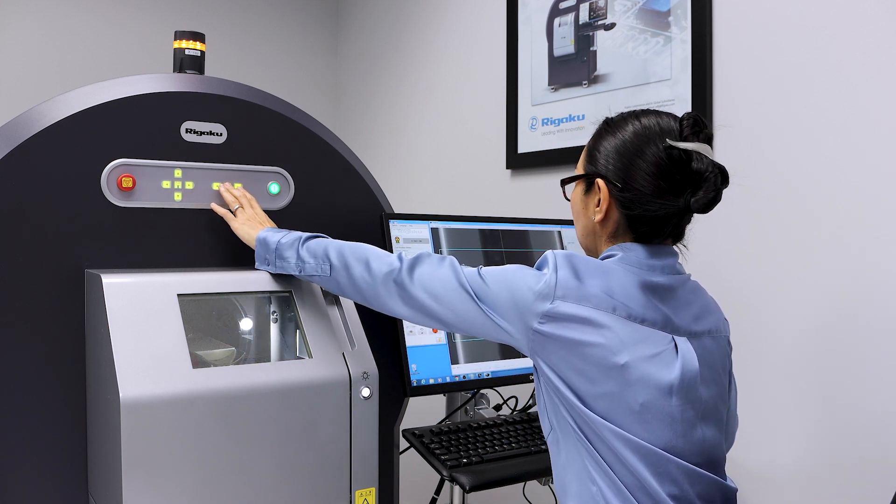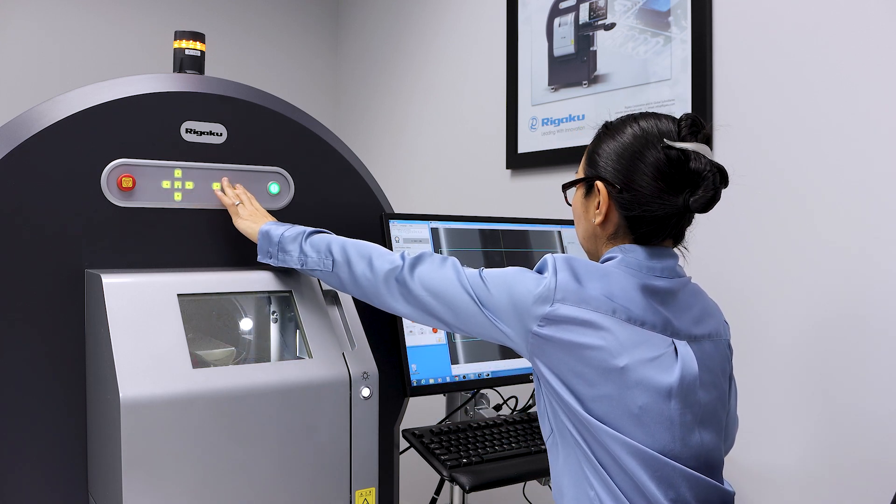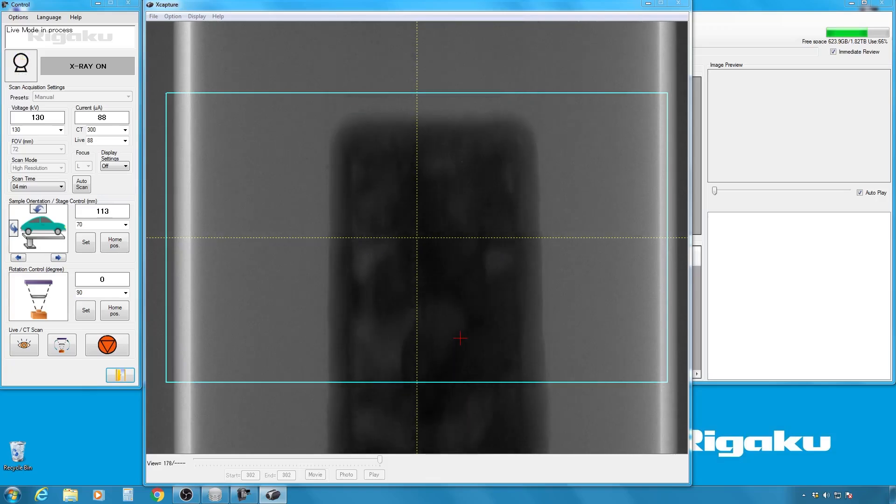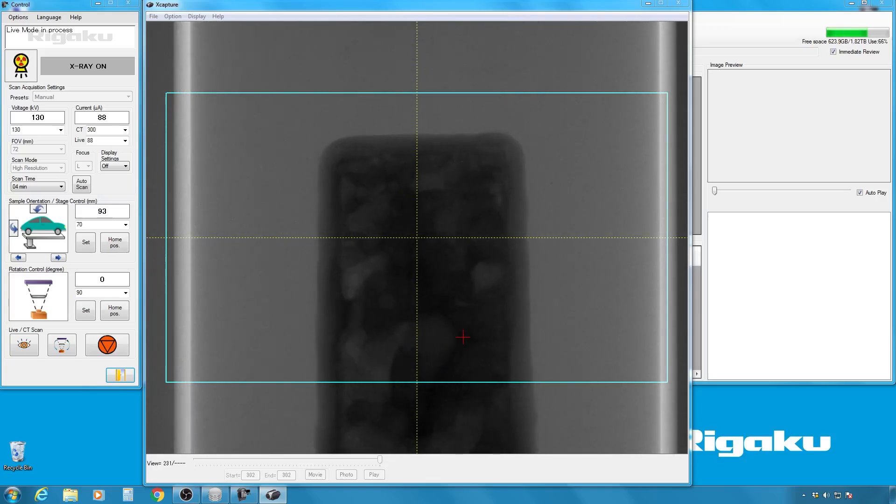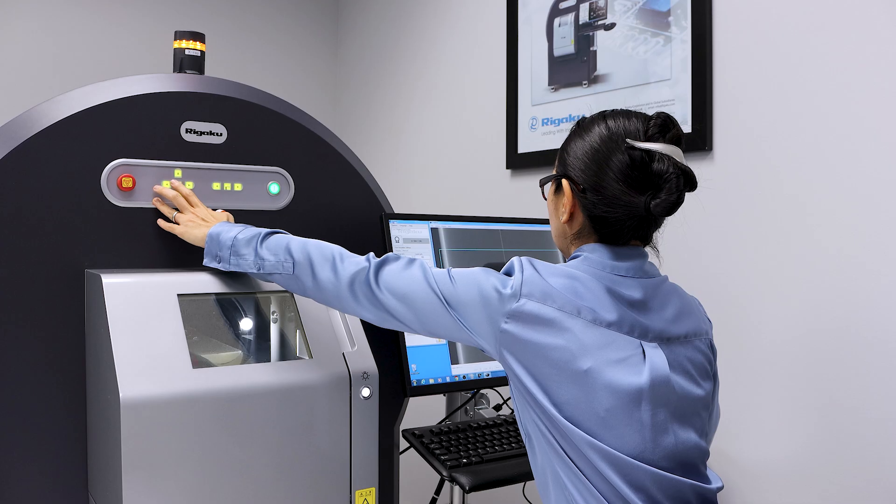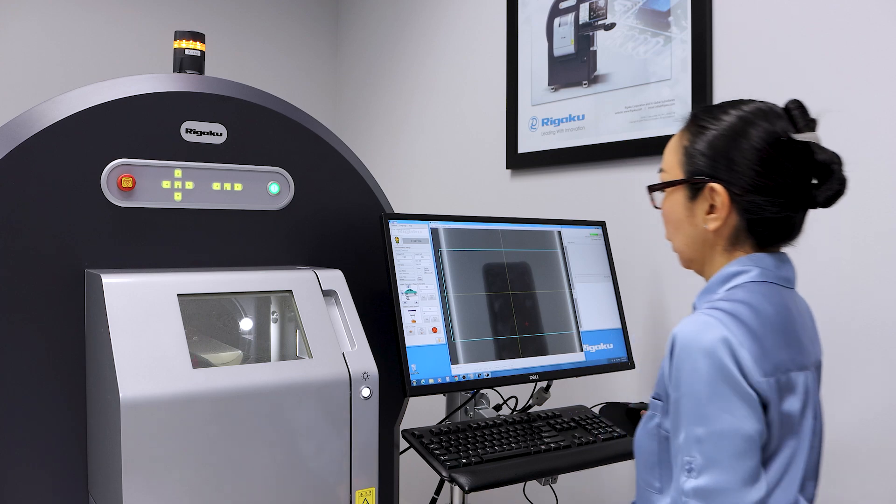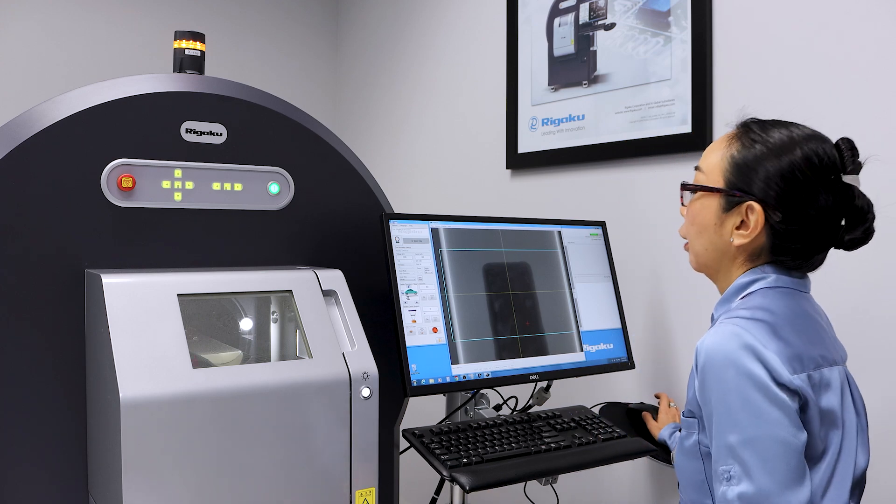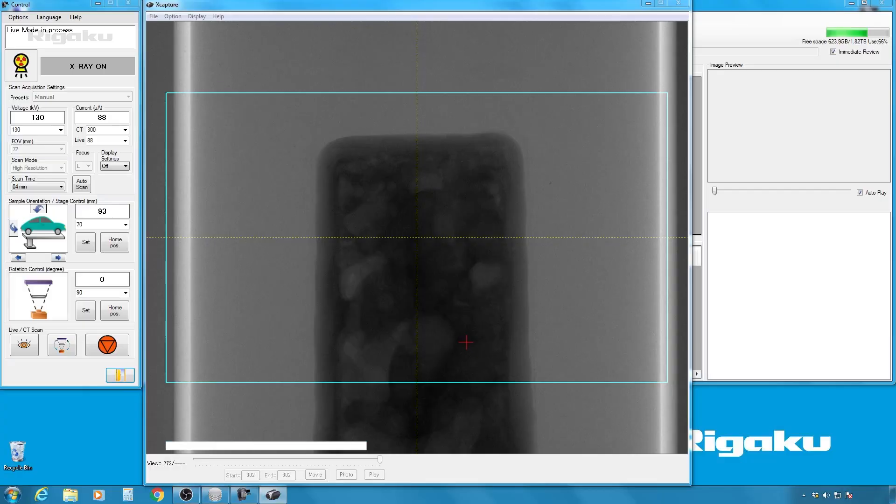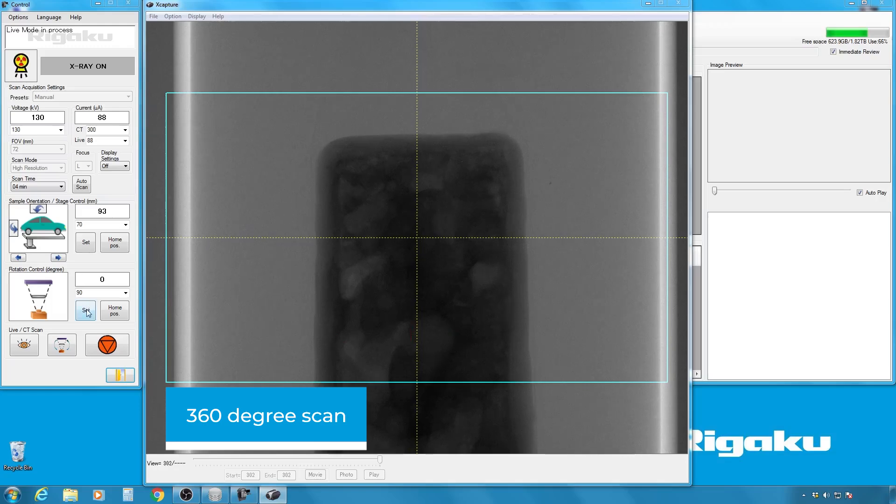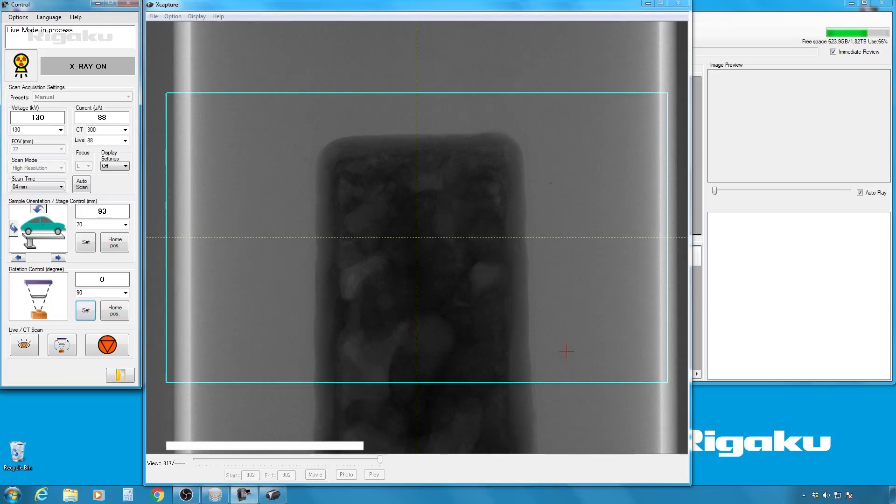So I'm going to use this one first, and that's about right. Do a little bit to the left, so that looks good. And now we're going to do 360 degrees scan, so I want to do this alignment at 90 degrees as well.